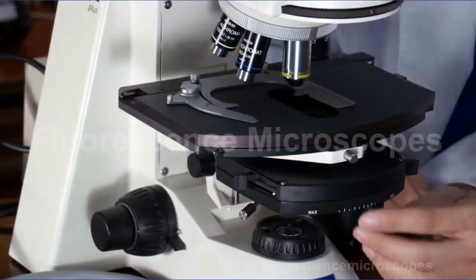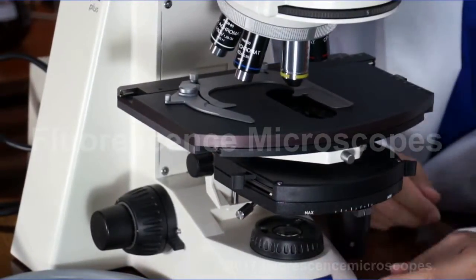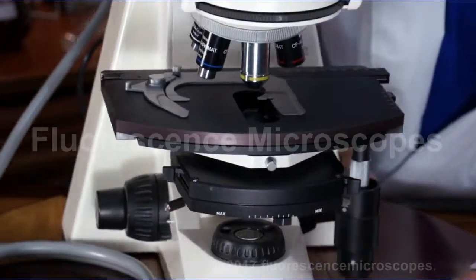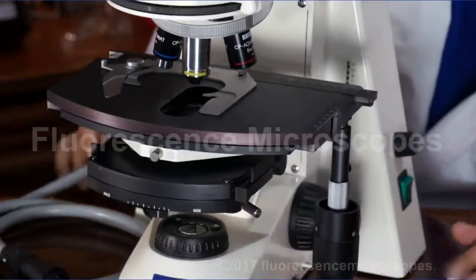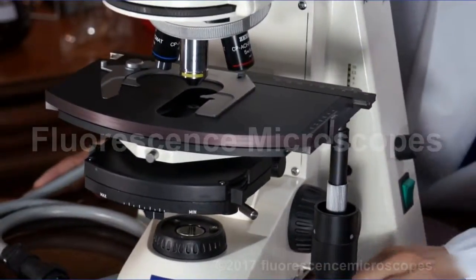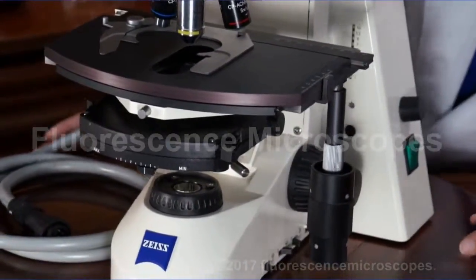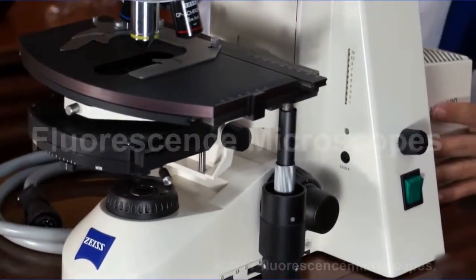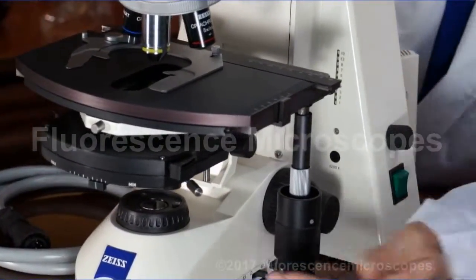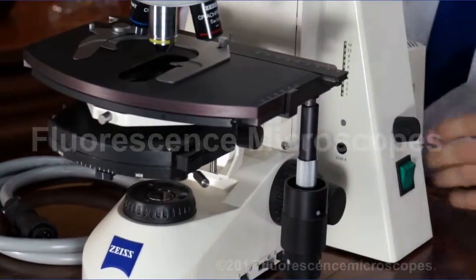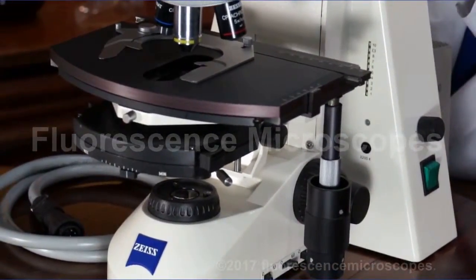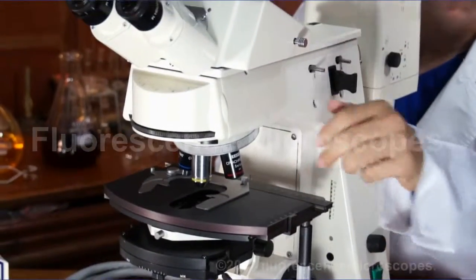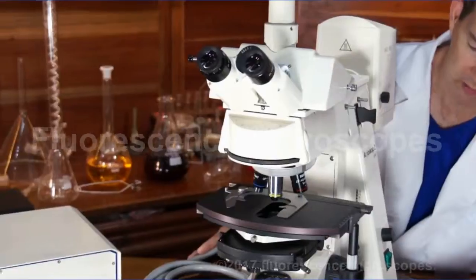You also have an iris diaphragm inside the condenser. And you've got some neutral density filters on the transmitted light. This is a halogen light source, the bottom light source, transmitting through the specimen. As opposed to reflected light from the mercury, which reflects down onto the specimen and does not transmit through the specimen.